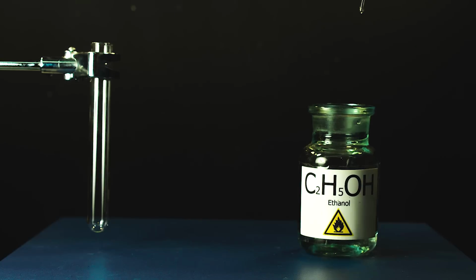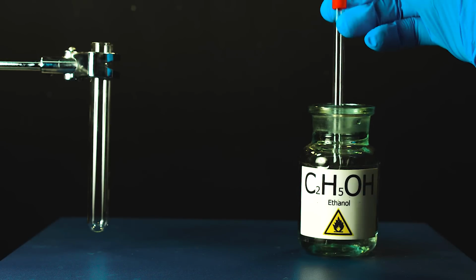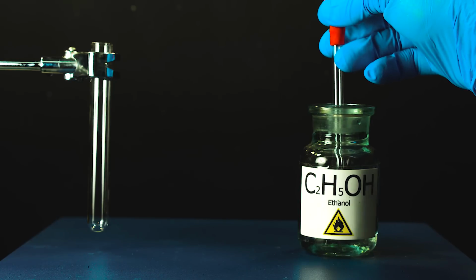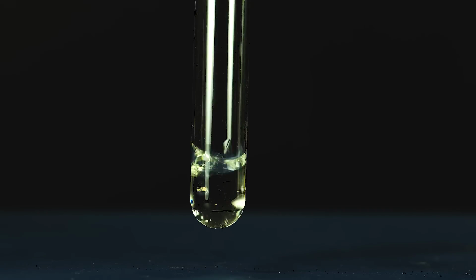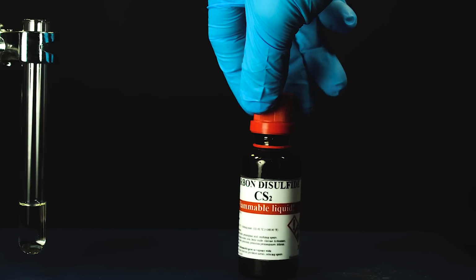Under the influence of carbon disulfide and alkali hydroxide, alcohols are transformed to xanthogenates, which are monoesters of dithiocarbonic acid, which can be recognized by their yellow color.